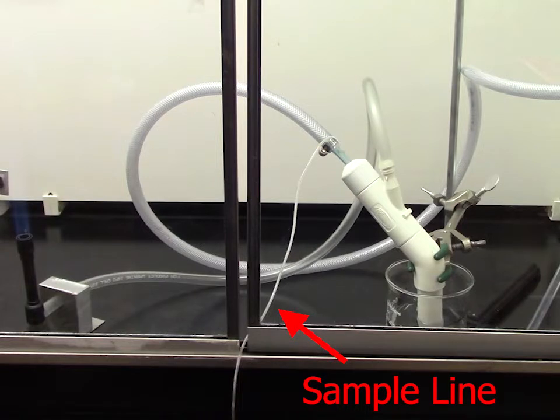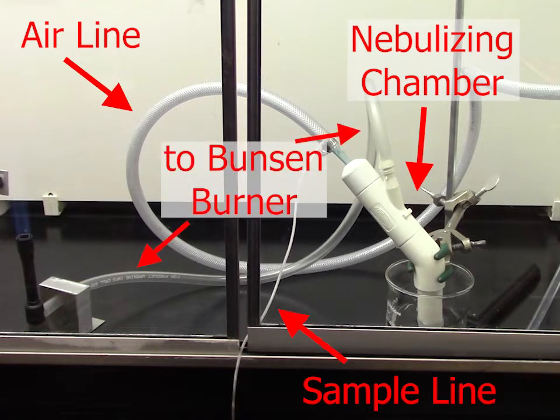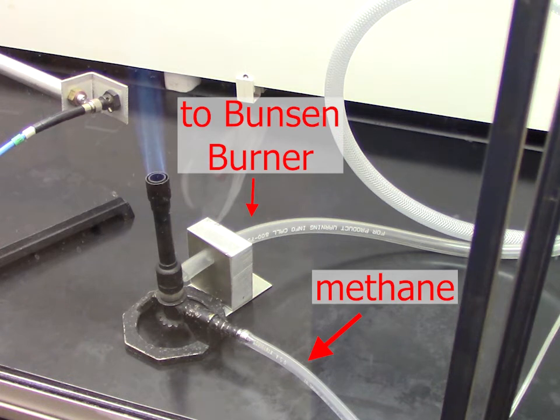and then air flowed through this line will suck your sample up and turn it into a fine mist in this piece of white plastic tubing known as the nebulizing chamber. Droplets that are small enough will then travel through this clear plastic tubing into the base of a Bunsen burner, where those droplets in air will be mixed with methane gas. The methane gas will carry the droplets into the flame.